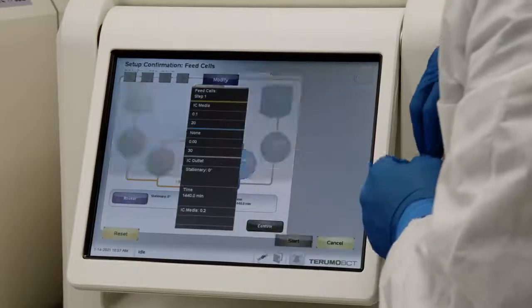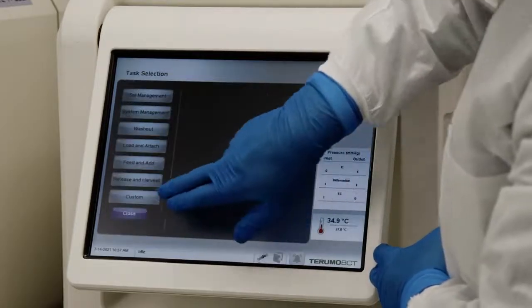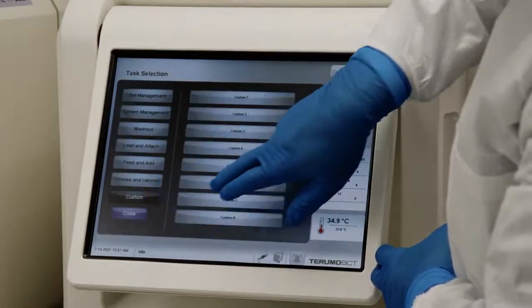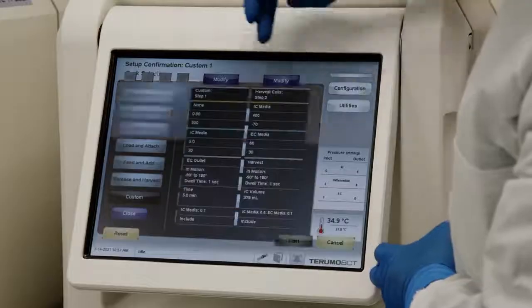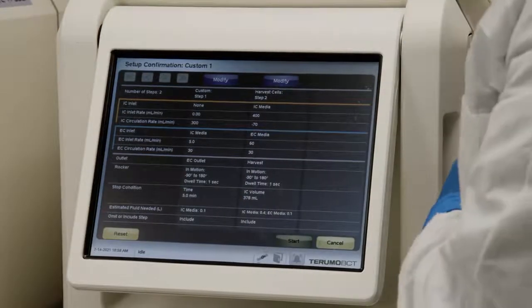You can also set up custom tasks similar to the one that we have programmed here. In this custom task, we have two different steps, but you can run up to 99 steps in each custom task.